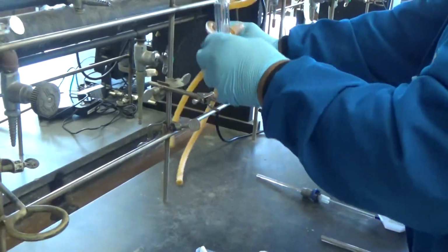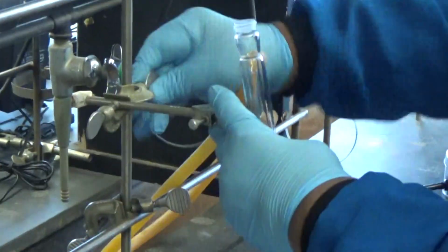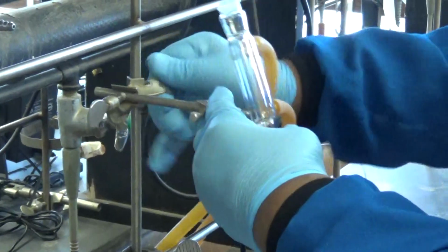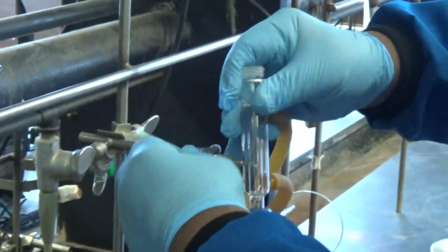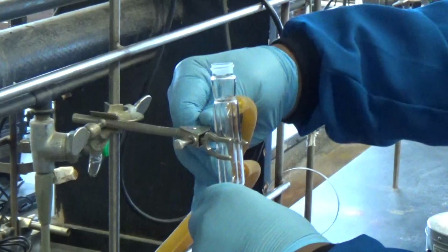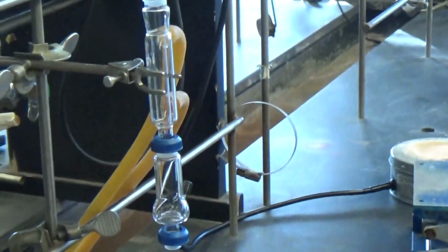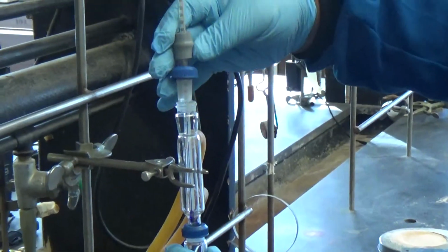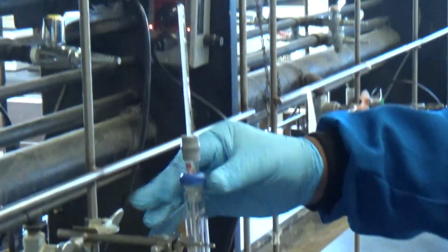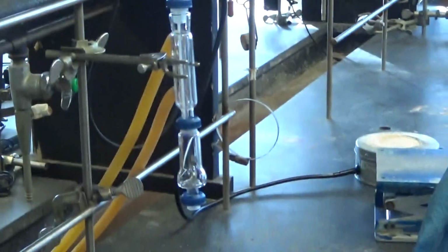Okay, so you're going to clamp it up? Yeah, I need to clamp that. It's better to clamp the condenser, because the Hickman head is fragile. Very fragile, yeah. And expensive too. Yeah, but those little plastic things hold it, so it shouldn't fall, but you never know. You still got to be a little careful. Pop on the thermometer adapter. And now I will show you how the setting should look.